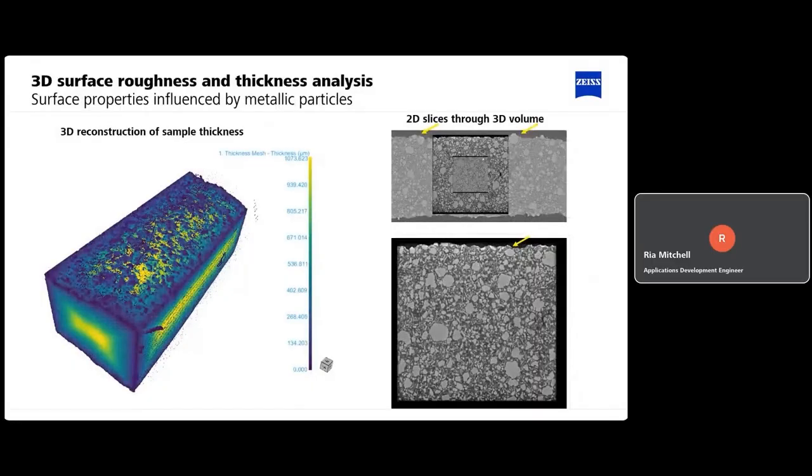I've talked a little bit about particle analysis, but I'm just going to touch on a few other things that we can get here. This is the entire width of our thermal gap filler. As well as particle analysis, we can do things like surface roughness and surface thickness of our samples. This could be an important measure when we're thinking about using these raw materials in our electronic devices. Sometimes roughness on a surface isn't all that helpful, so we can measure that from the 3D volumes.